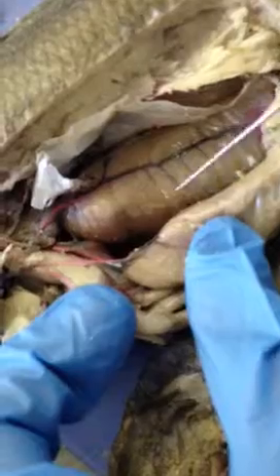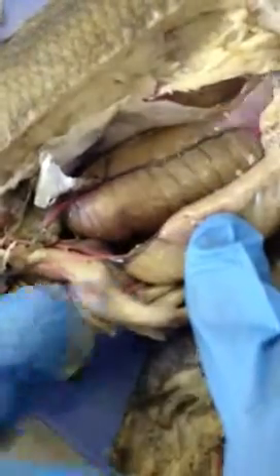If you trace it all the way back up, you can see that it attaches to the dorsal aorta. In males, there are two separate pairs, and in females, they all join together and form one. But you'll have one artery on either side of the ovaries or the testes. So look at that nice dorsal gonadal artery.